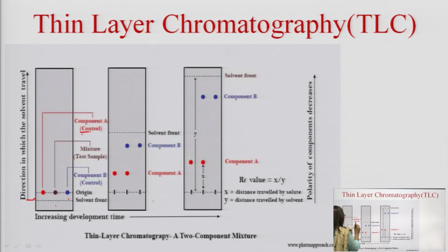This is the control, that means standard. Supposing we have to assess an unknown sample from the market containing an alkaloid named morphine or so.